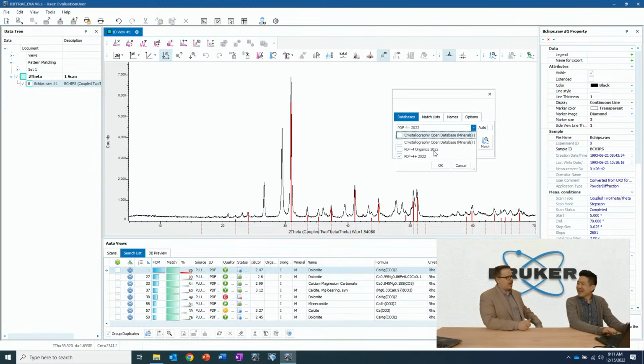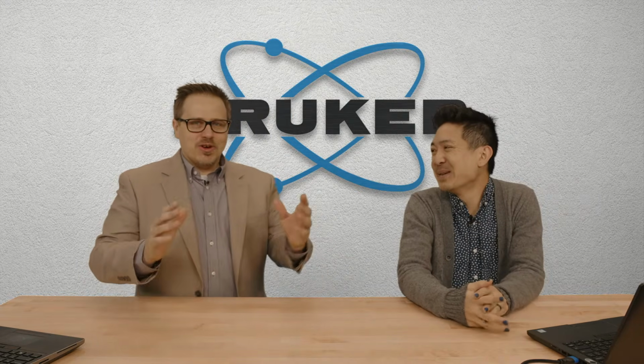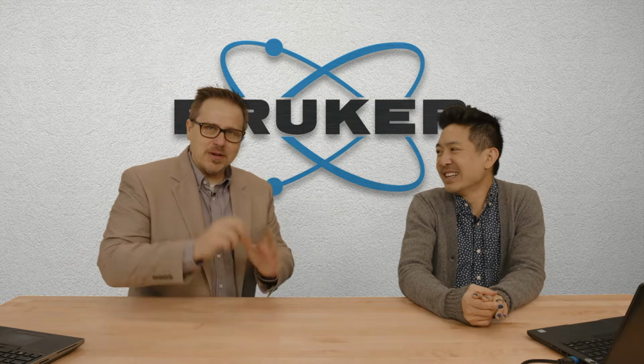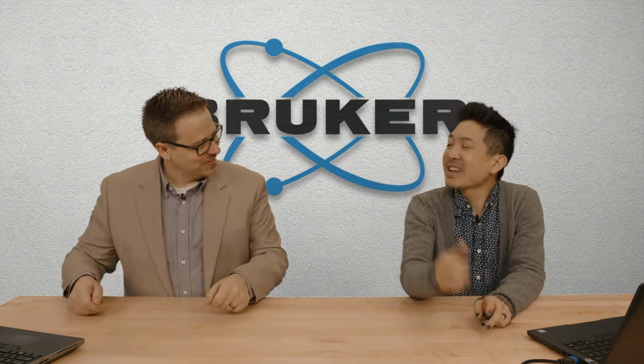I'm aware that back in the day there was a book. What we used to do at the university, and it was kind of torturous to students, I shouldn't say that, but first you had to start with the sample. Now you got to grind it for like 2 hours. You got to grind it, make it perfect, and then you got to run it. And after you run it, you got to find the tallest peak, and then you look it up in the book. It's like indexing by hand.